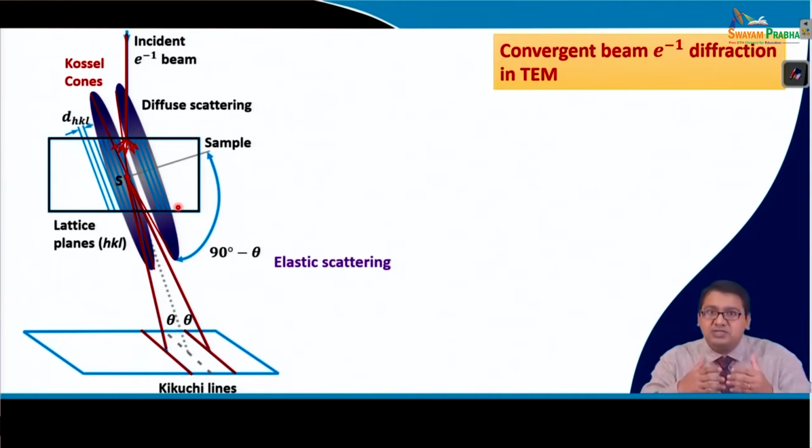So, what is the technique? In that thin specimen, a little thicker place is chosen, and then the incident electron beam basically falls on the specimen. When this electron beam falls on the specimen, it starts to scatter. The electrons interact with the atoms and start to scatter, and when they scatter, they scatter in all possible directions, right.